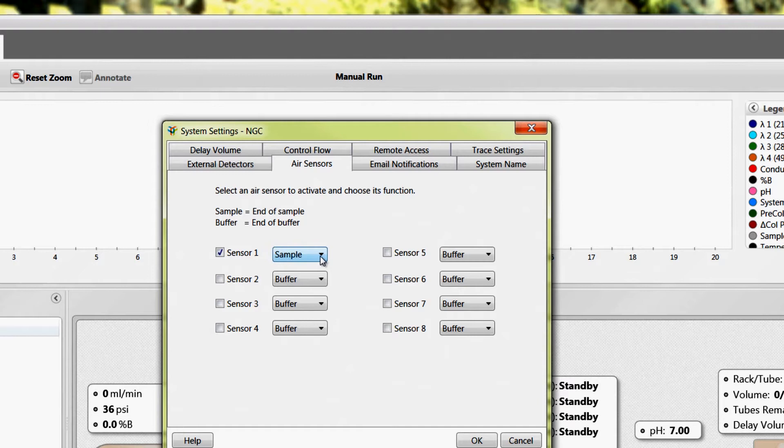Designate which air sensors will be used to detect end of sample or end of buffer. Be sure to check the box next to each air sensor you wish to be active. Air sensors designated as detecting end of buffer will stop the NGC system pumps when triggered.